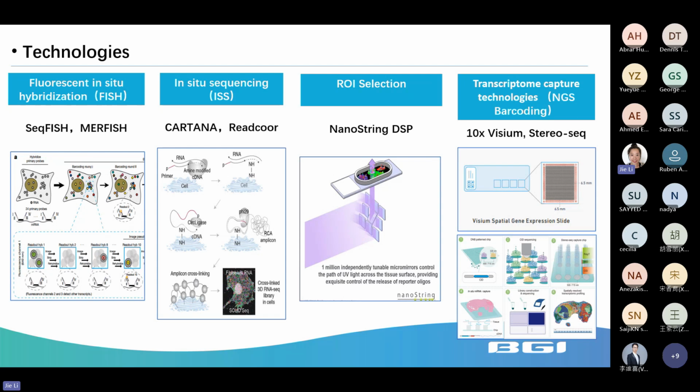Sequencing-based spatial transcriptome still faces challenges such as cost and the complexity of data processing. So now many research groups are developing effective data analysis tools and integrating spatial transcriptomes with other omics technologies to demonstrate comprehensive and complete regulatory networks in different research fields.